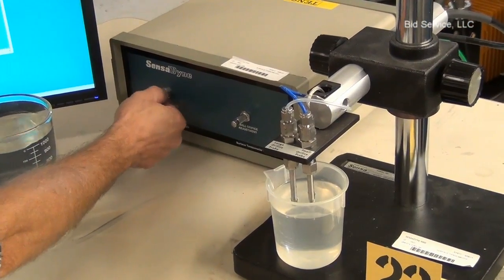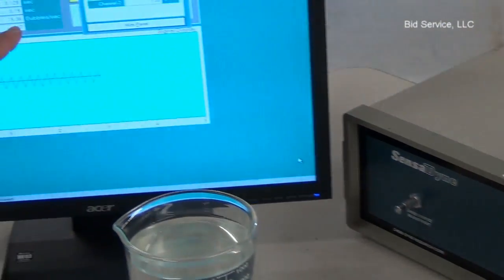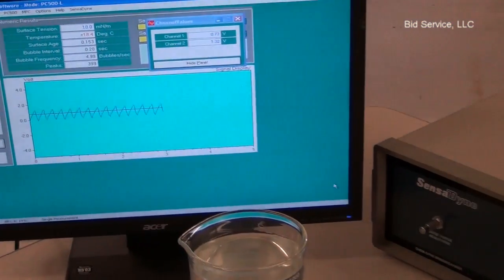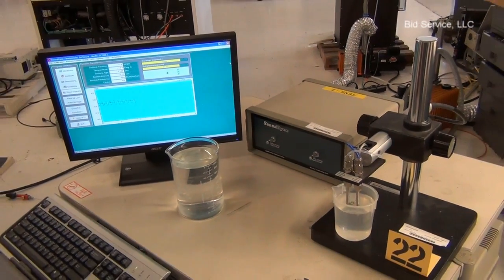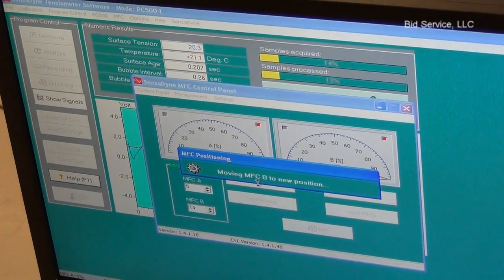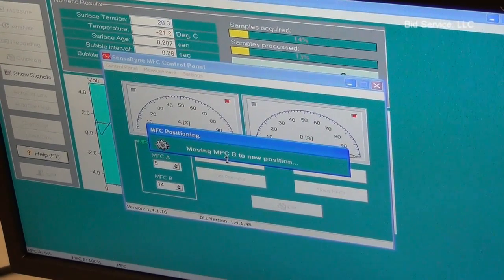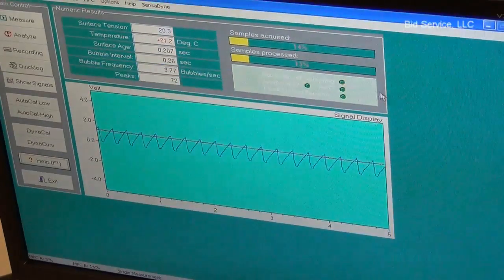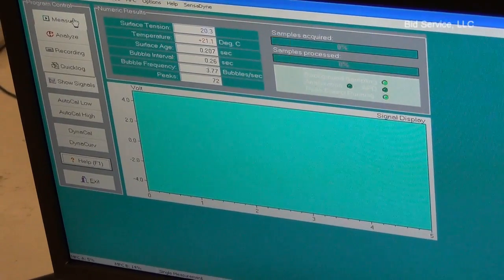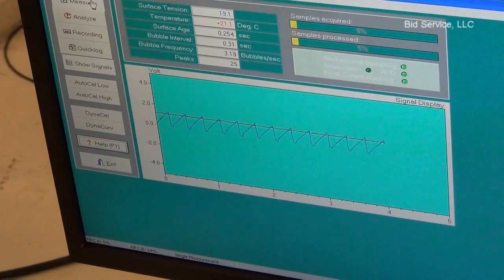I'll show you the bubble frequency changing — increasing flows. I was at 1, now we're at 5 on the bubble frequency. Now it's adjusting MFCB. Now we'll do a measure again. You can see the sawtooth wave at the generator.